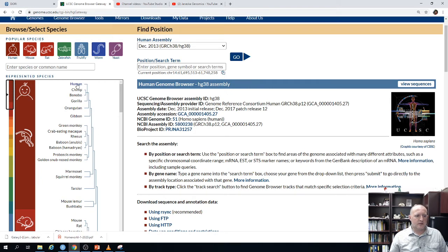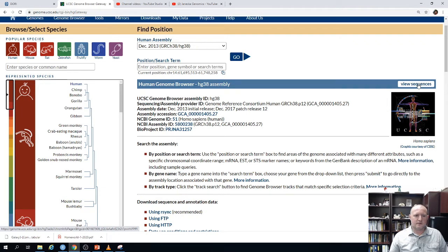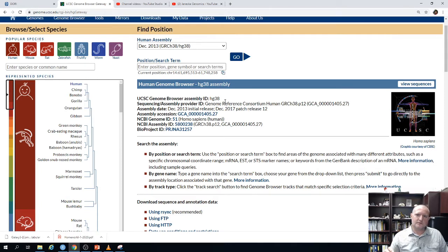Now we're going to focus on the human genome. One thing I like about this browser is the information is organized based on the phylogenetic evolution and relationship of the species. If we click human at the very top, we have a link to go to the human assembly.